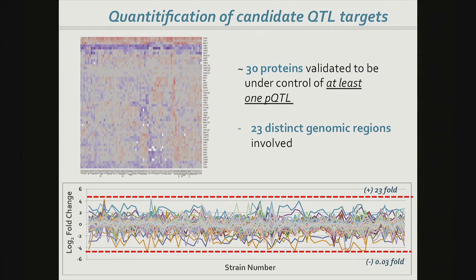And then all of these 50 proteins she quantified by SRM in each one of these strains. So this is a data matrix that came out. This is something you have also seen throughout the week. These would be the strains, these are the proteins, and it led to an almost complete data matrix, which of course is nice. So now what does this matrix tell us?